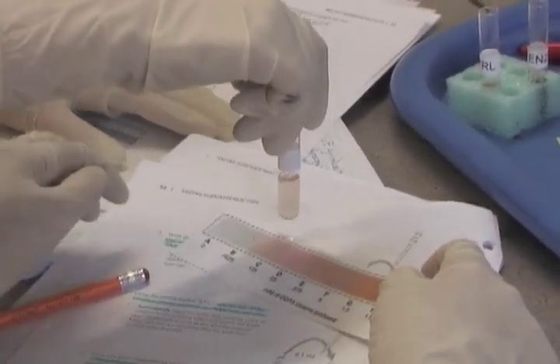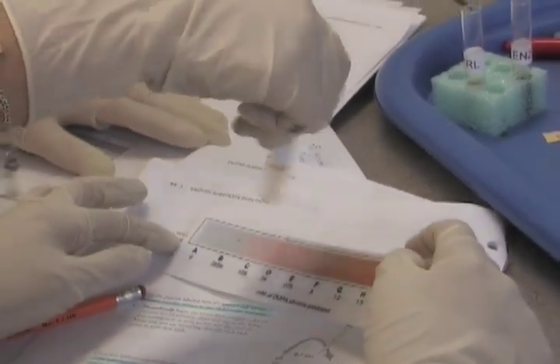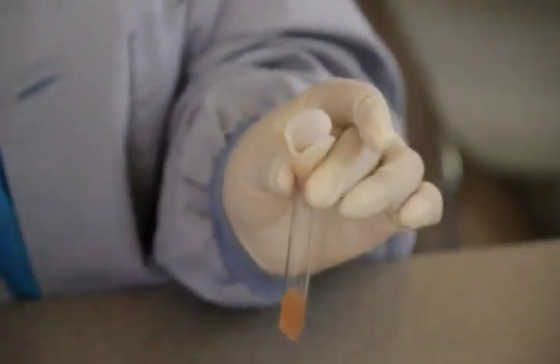Congratulations! You're done with each trial. Remember to dispose of your materials. Next, you will be analyzing your results. Today, you will follow these steps to learn about enzymes and enzymatic reactions. From taking an easily extracted enzyme from portobello mushrooms, you can observe these reactions using different variables to learn about the functions of enzymes and how they work.